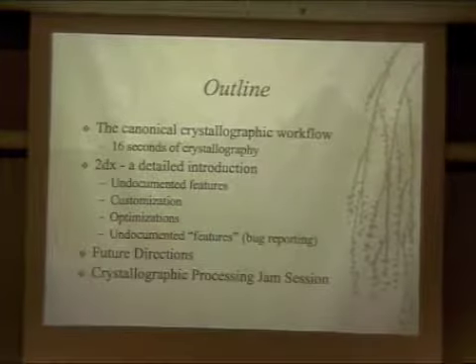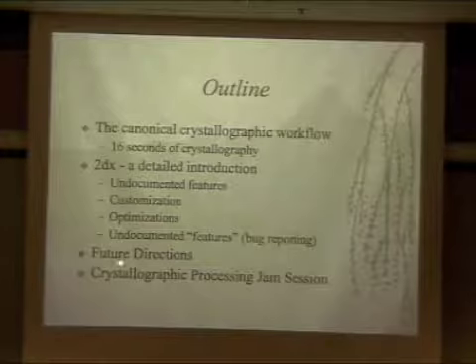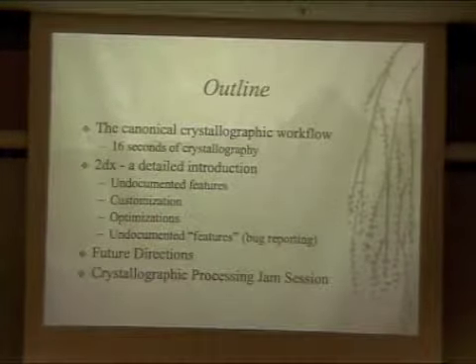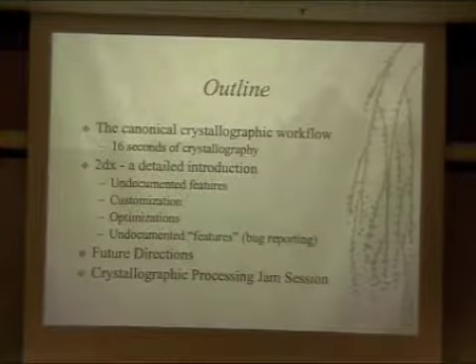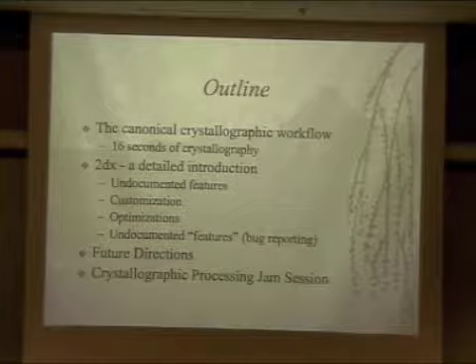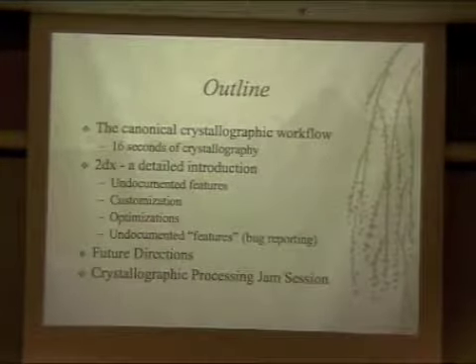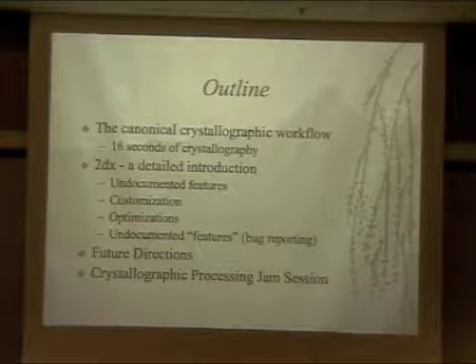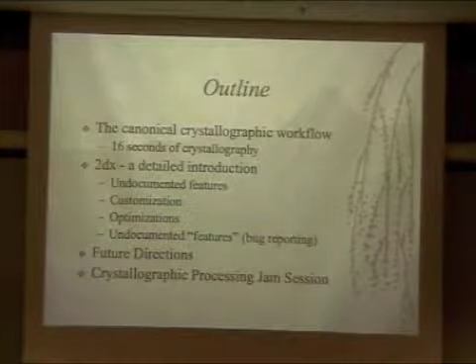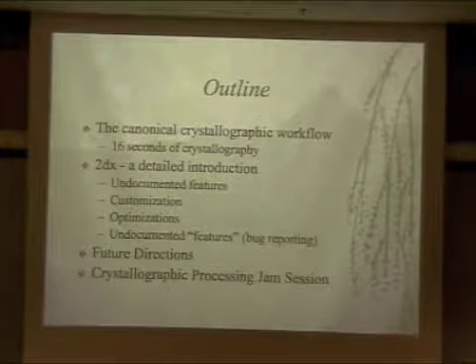Some of the customization. Actually, 2DX is an extremely customizable platform, and the way that you should think about what we've written here isn't so much an image processing solution, but more a wrapper that organizes parameters and calls programs systematically. And so what we've done by giving you scripts isn't to try to present the be-all, end-all of crystallography, but to give something that we think is an extremely good suggestion on how to do crystallography. So there's a ton of customization you can do here if you have something working in your own lab.